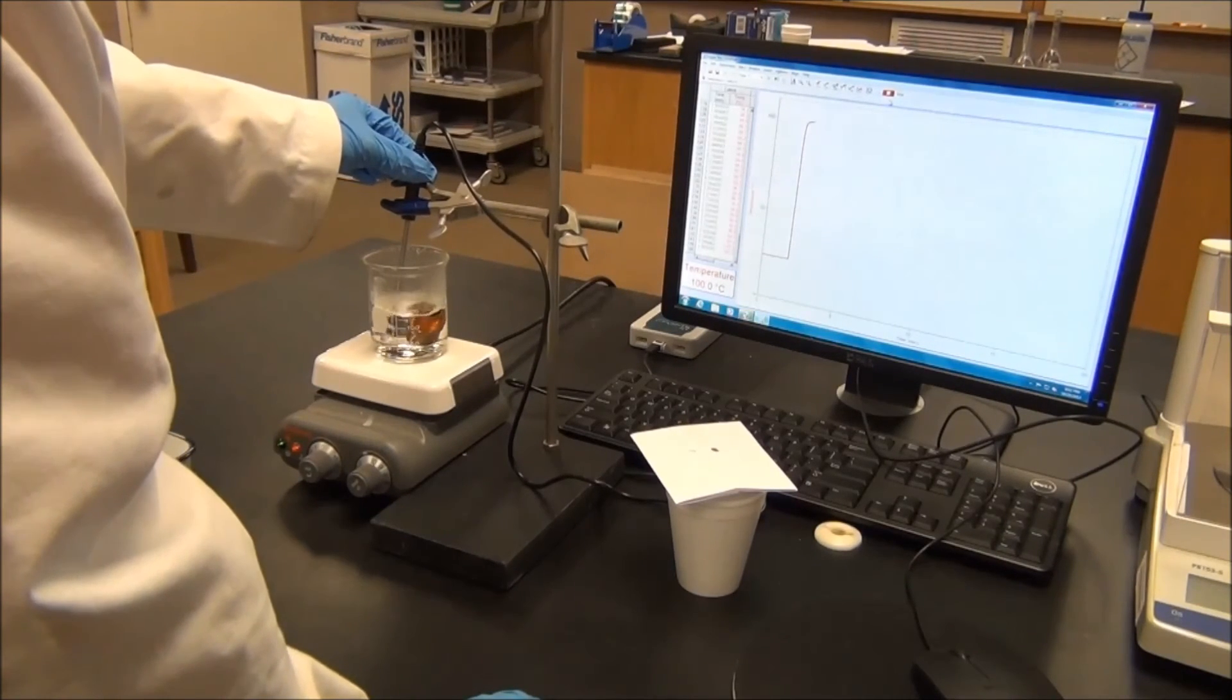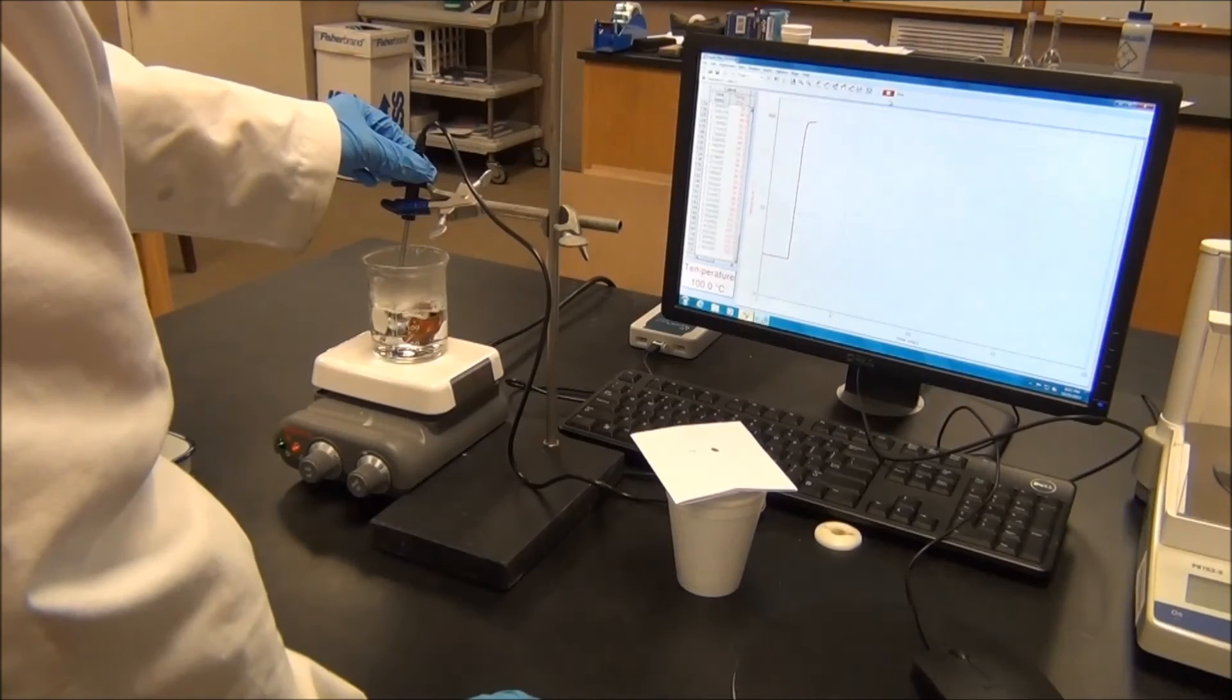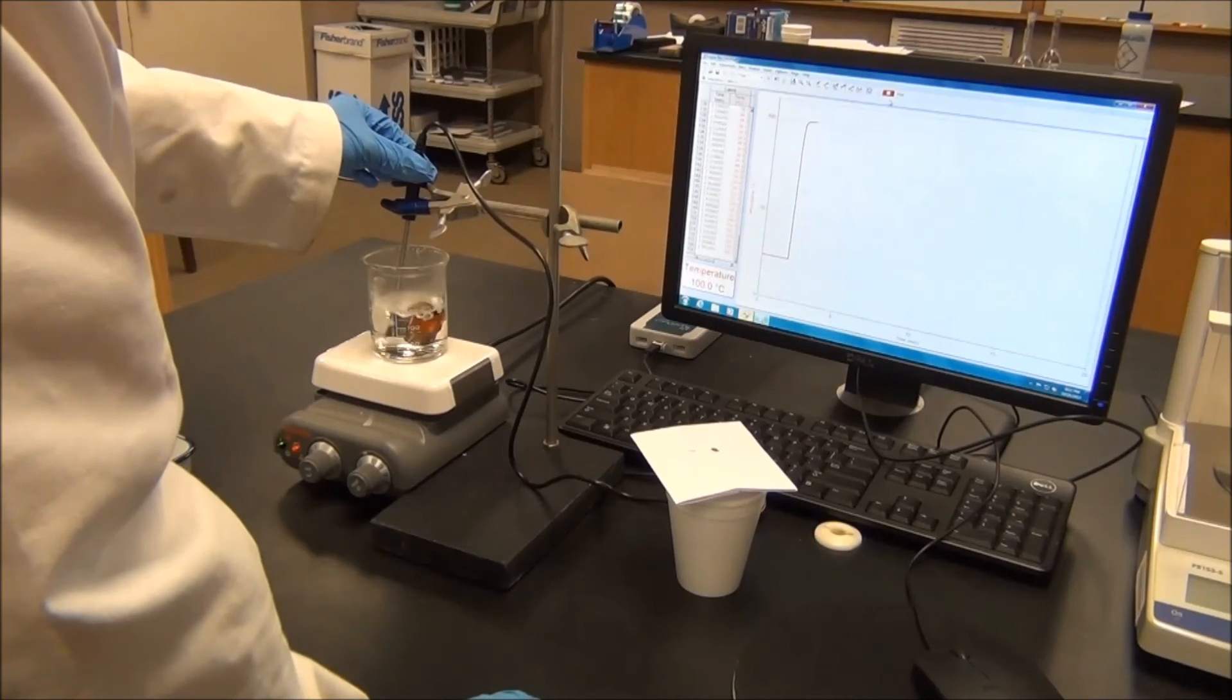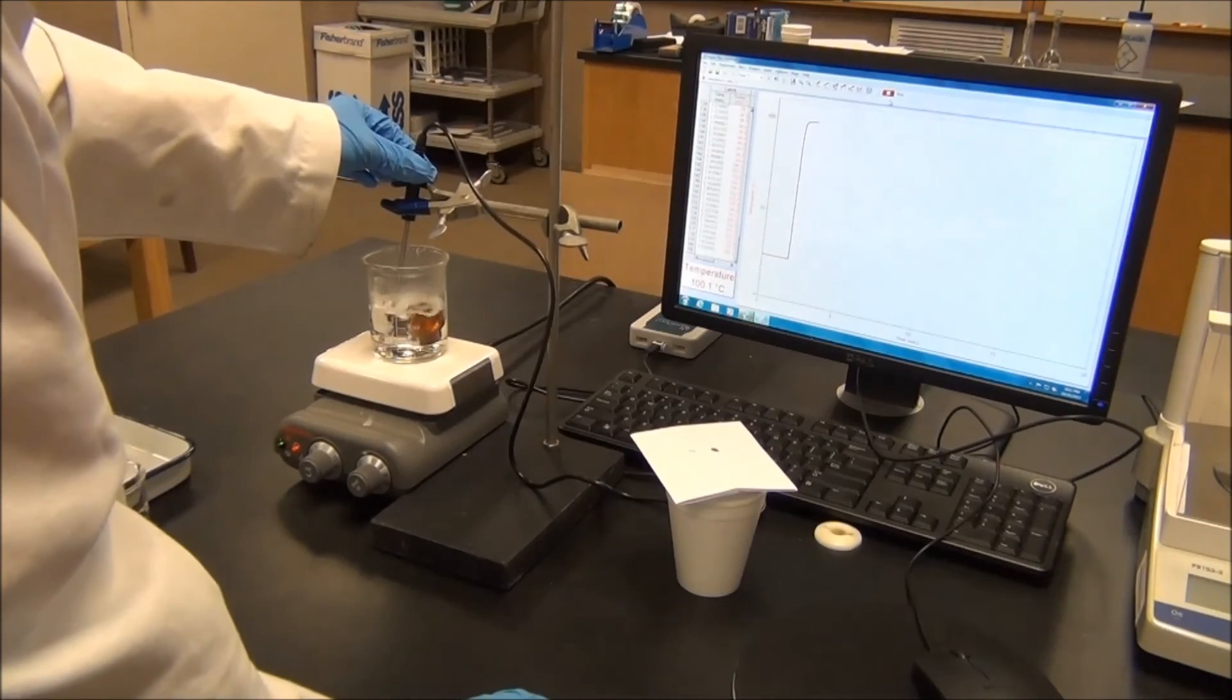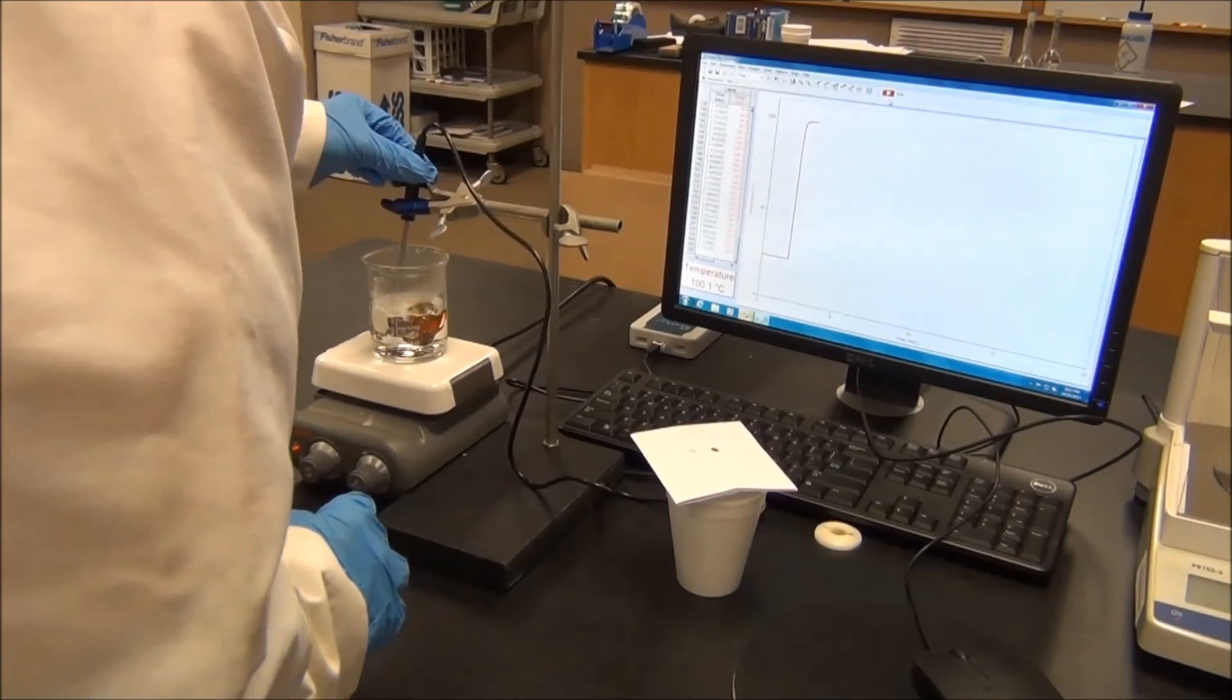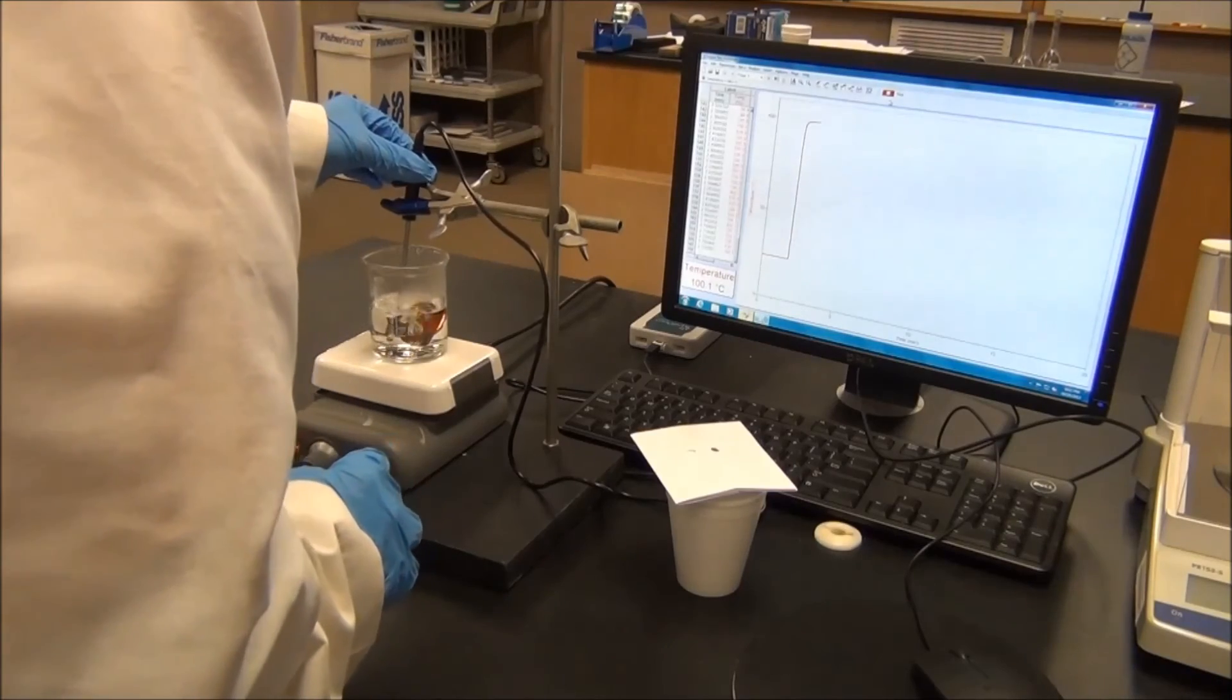And make sure for your temperature probe, do not touch the bottom of the glass beaker. Because that temperature may be different than the temperature of water. Which we assume the temperature of the metal piece is the same as the temperature of water. Right now, from the screen, we can see that the temperature reading is pretty constant. So we will take out the temperature probe.